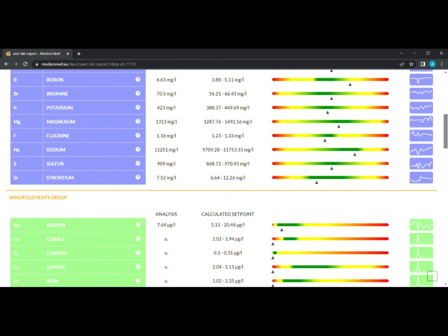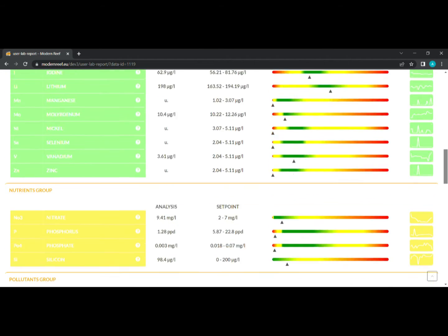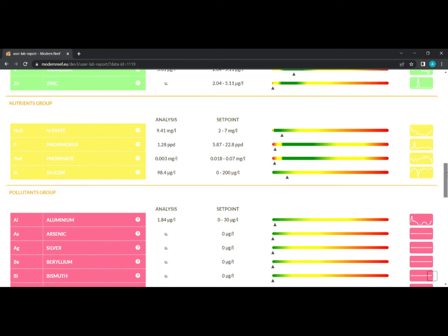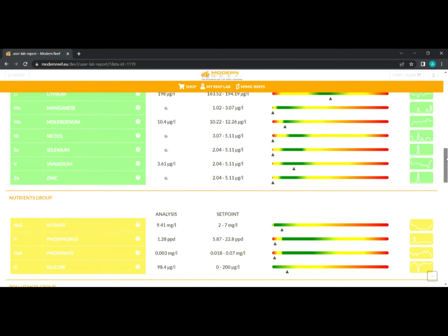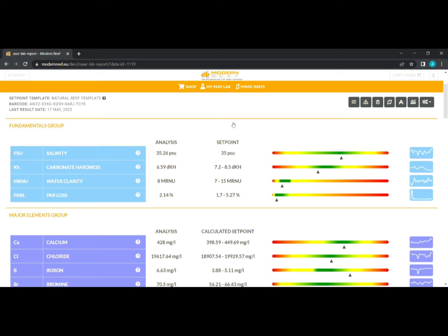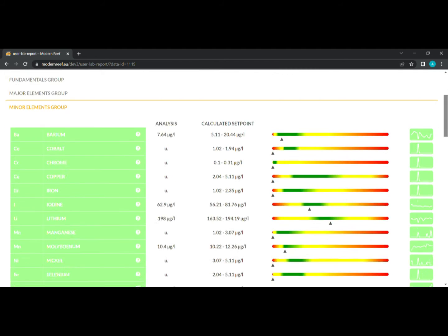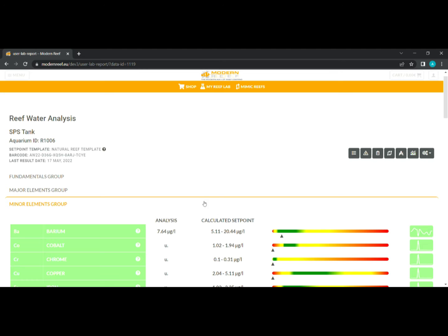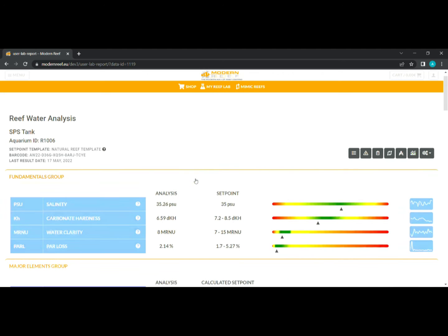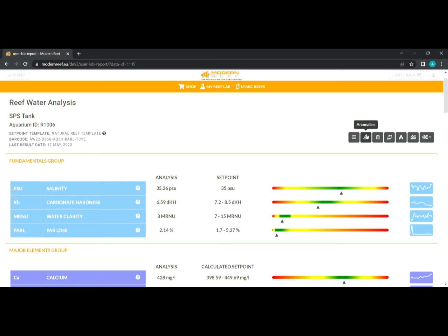What else? Well, you have the barcode, of course, and everything is made by colors so that it's more pleasant for the customers to see it, or for the users. You can even close some of them, leave one that you are interested in, and open them again. Now, after this, for example, you have the anomalies.